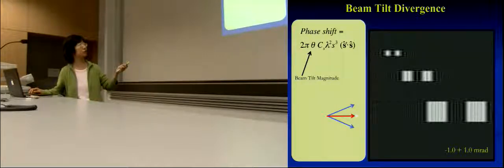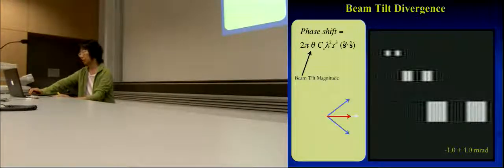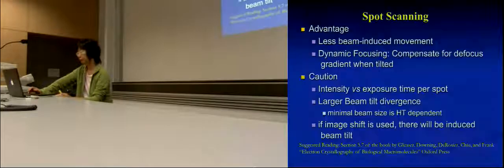And the definition where it went dark is still dark in almost about the same way. Because this is more like a B factor effect, it no longer affects the phase. So the problem, you may say, to our structure determination is less, because our structure is more sensitive to a phase change than an amplitude change. Okay.